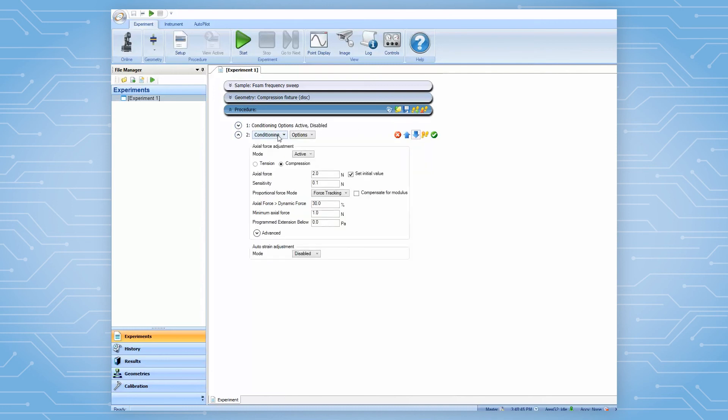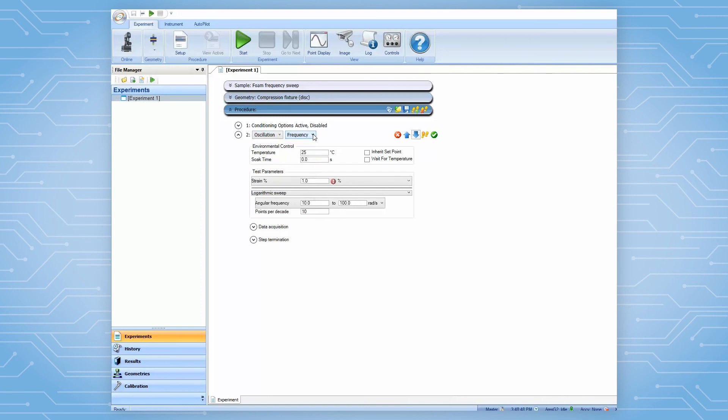Then, in the second step, set up the specific frequency sweep test parameters.